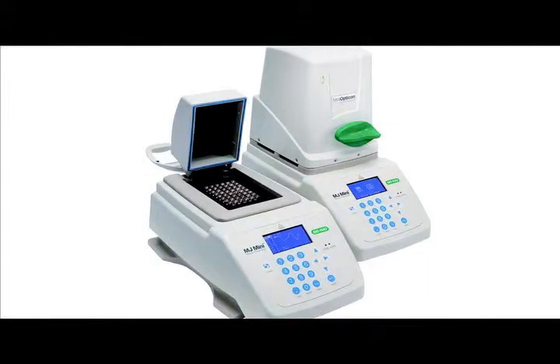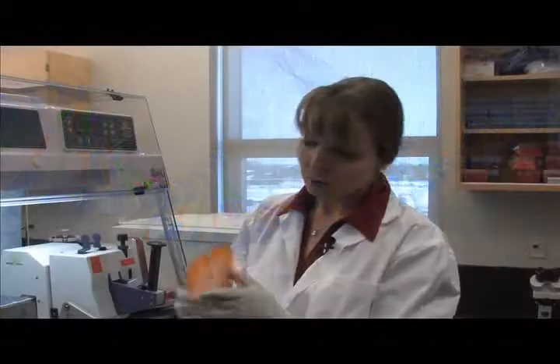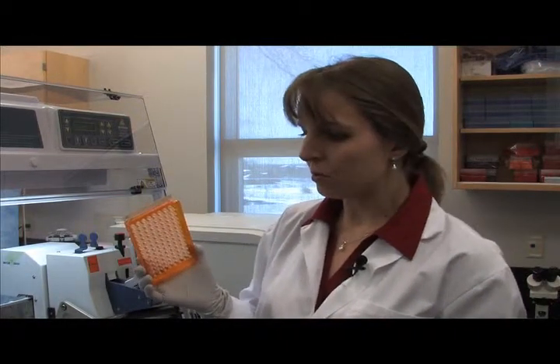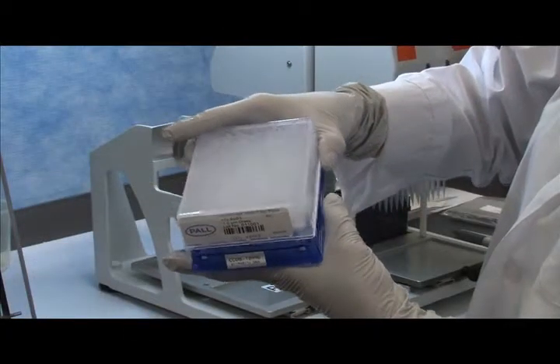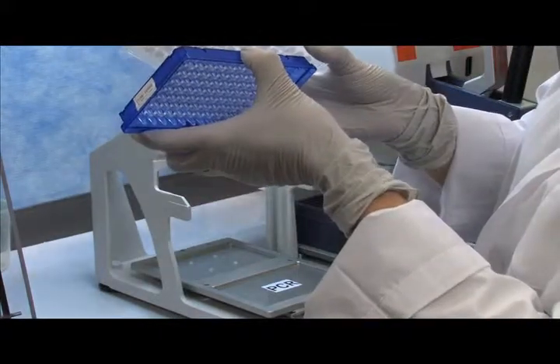Once the DNA is extracted, we proceed to the DNA amplification step using PCR. This is pre-made frozen PCR plate which contains everything: primers, Taq polymerase, dNTPs and all components required for polymerase chain reaction. Now we have DNA extracted from a fiberglass membrane into a collection plate which is used for PCR setup.